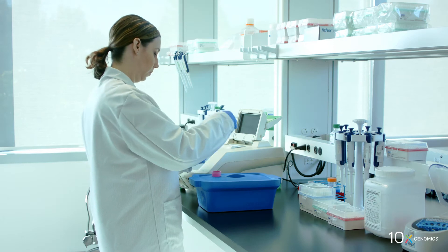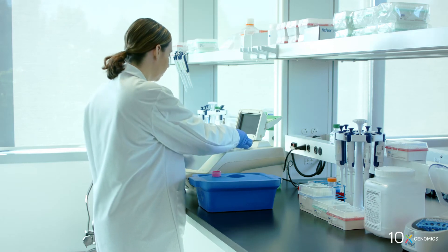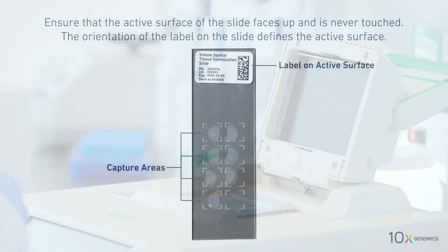Immediately place the slide on the thermocycler adapter with the active surface facing up. Ensure that the active surface of the slide faces up and is never touched. The orientation of the label on the slide defines the active surface.